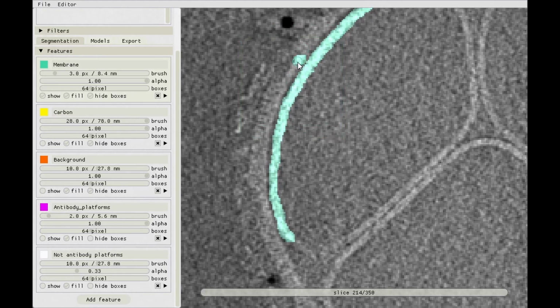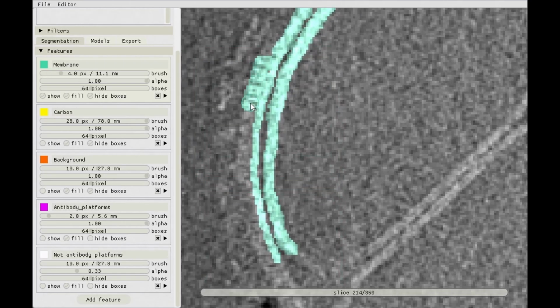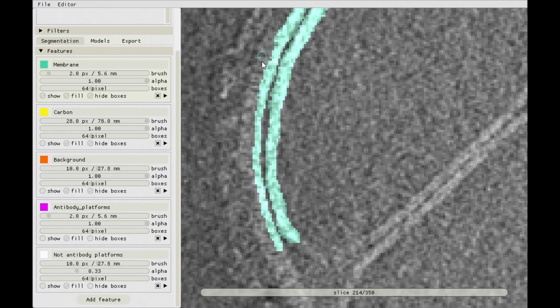So over here the membrane would be just this bit, and actually not the stuff in between, because that's a gap between two adjacent membranes. And what we shouldn't do is annotate this section, which does look like membrane, but since we know that these are actually the fab domains, it's not part of the dataset.